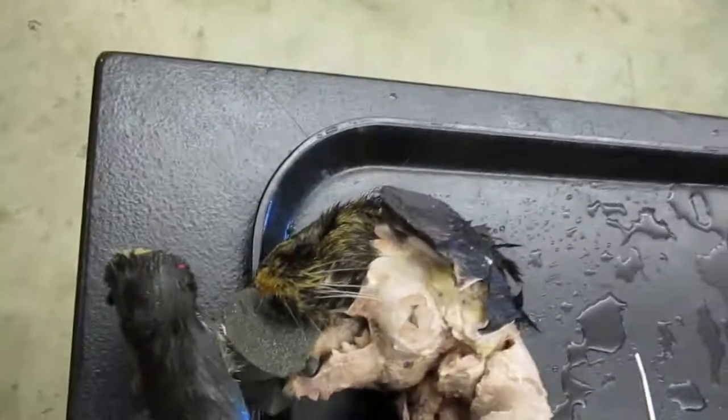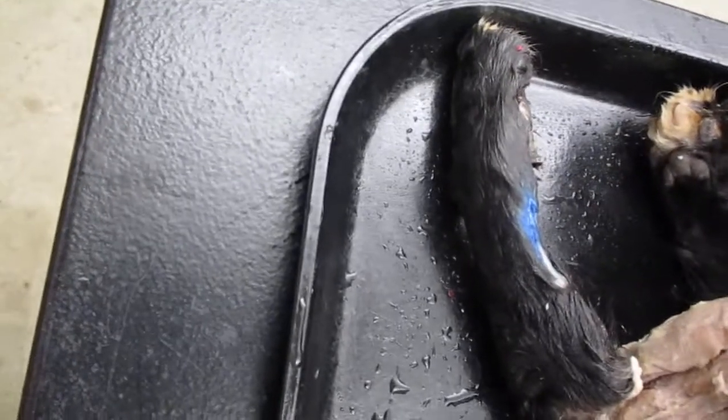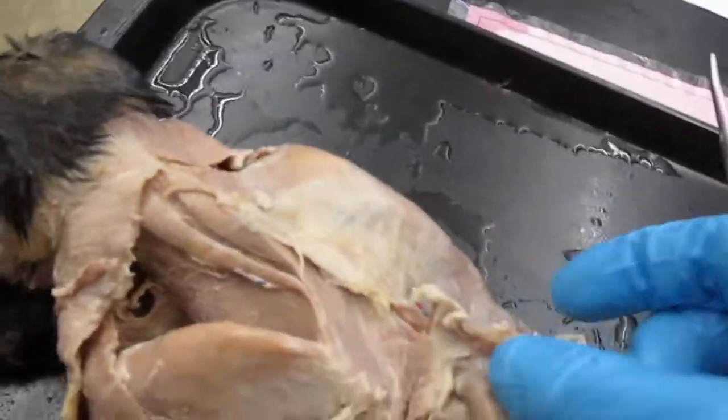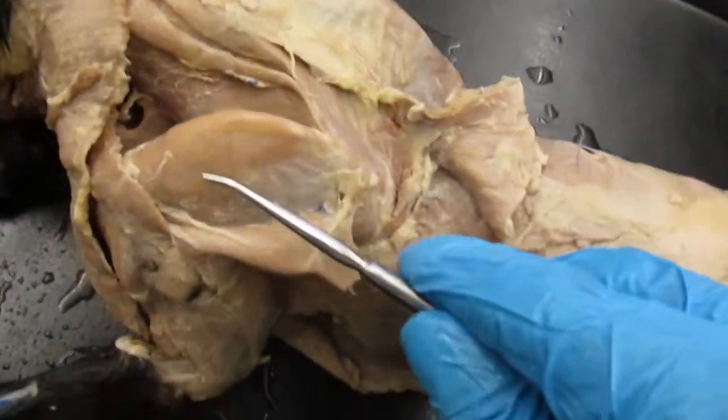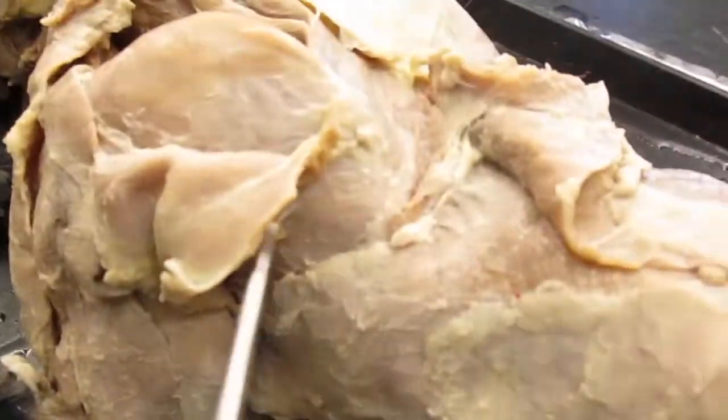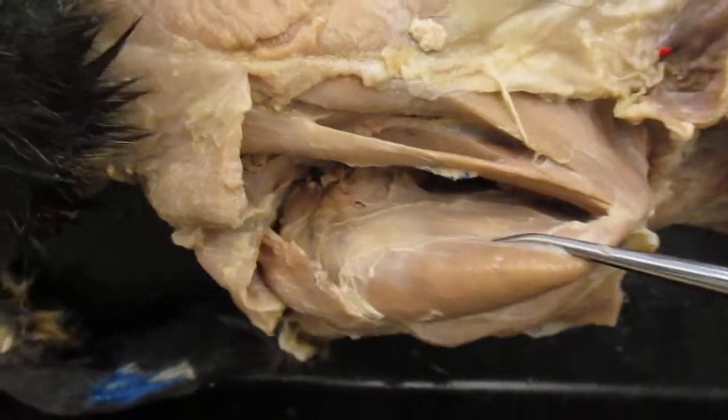I want to show you some more structures, more muscles, excuse me. Pardon what I said. More muscles, more skeletal muscles. So, let me prop this cat up here. And we're going to look at some muscles underneath the trapezius muscles. So, right here, we can pretty much see the supraspinatus. And then you can see the infraspinatus again. Right there, supraspinatus, infraspinatus, and then your subscapularis is right in there.